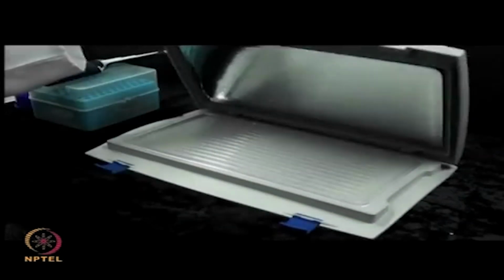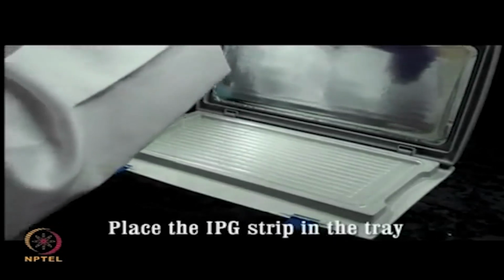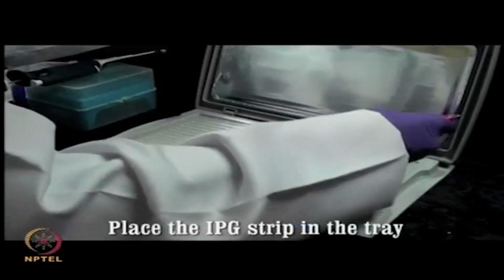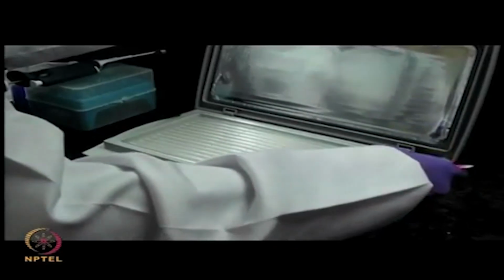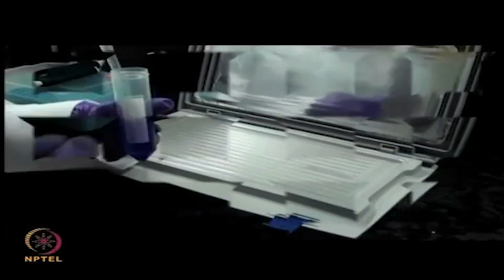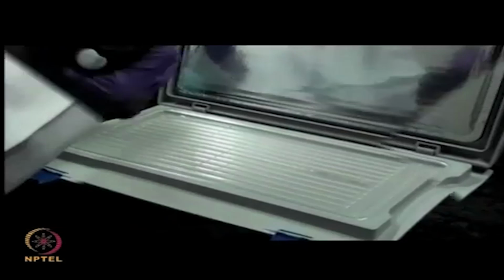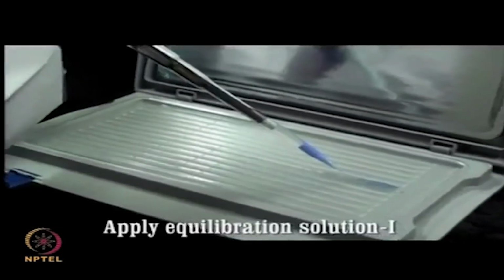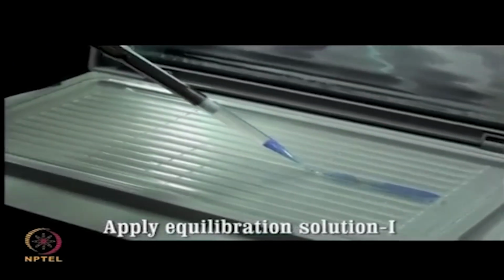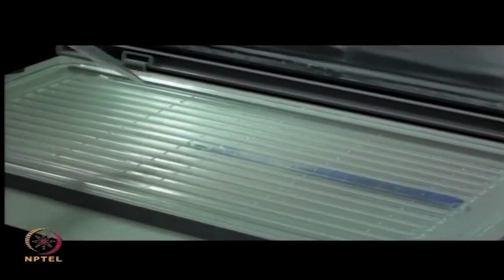Equilibration of IPG strips. Place the thawed IPG strip in the tray and over it pour the first equilibration solution consisting of urea, Tris HCl of pH 8.8, glycerol, SDS, bromophenol blue along with dithiothreitol or DTT.